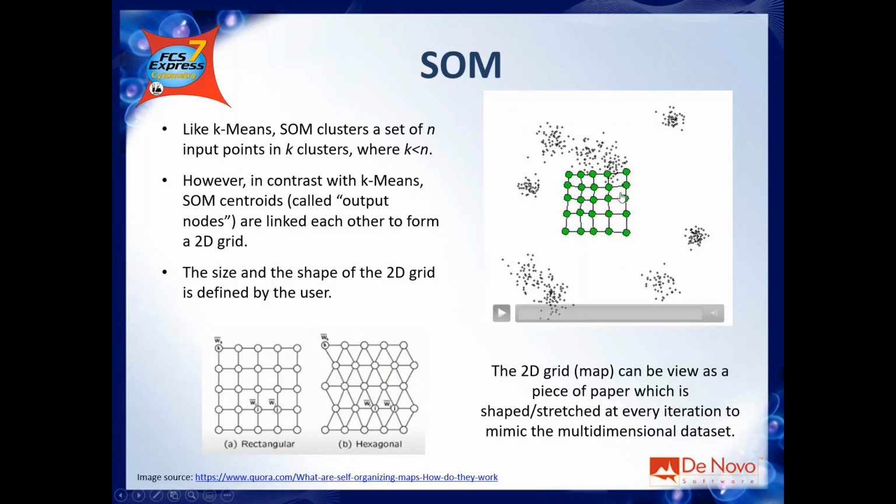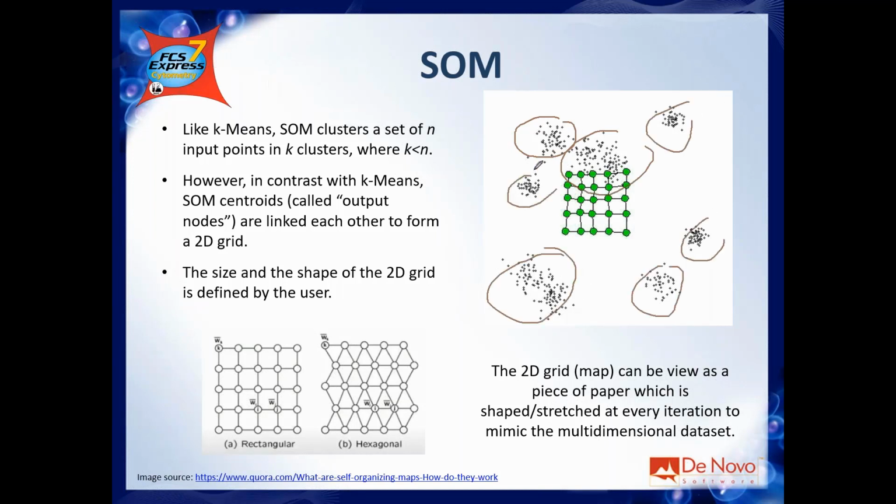Now, before starting, just have a look at this animation, okay? You have some, let me draw here, you have some populations, you see here. Those are all the events, let's say, of your data set. And in your case, those are biological populations. And those exist in multiple dimensions. Now we have just a 2D representation, but they exist in like 20 parameters when you have a 20 color experiment. And you start at the beginning by creating a grid.